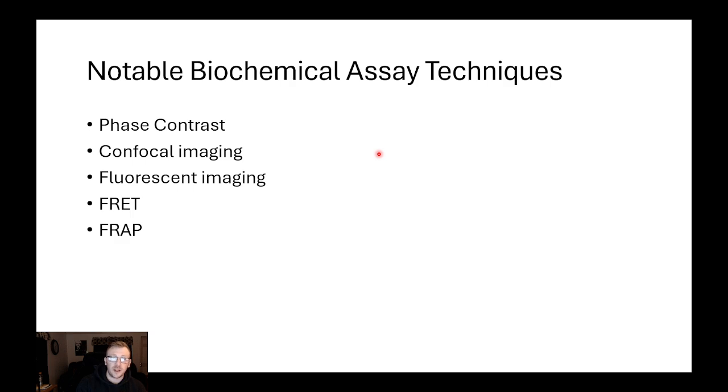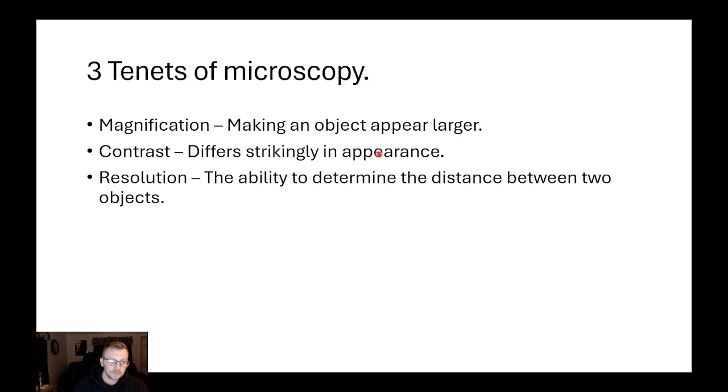And then finally FRET and FRAP, which I'm not going to talk about in this video specifically, but we're going to talk about it later, which is where we're looking at localization events of molecules using fluorescent probes.